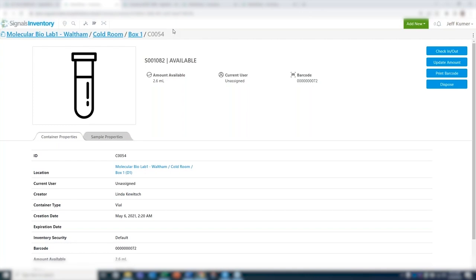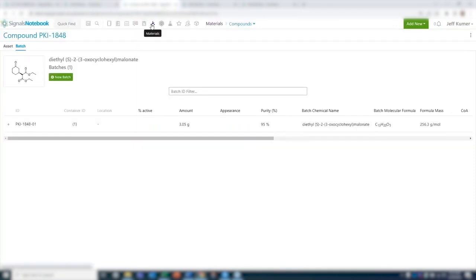Alrighty. Can we use this inventory and consume materials for routine reagents or consumables as well, like salts or solvents? Absolutely. As a matter of fact, there is a way to order those reagents and keep track of them, so that you're just adding in the materials library.